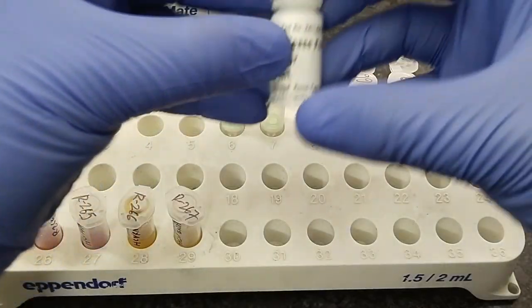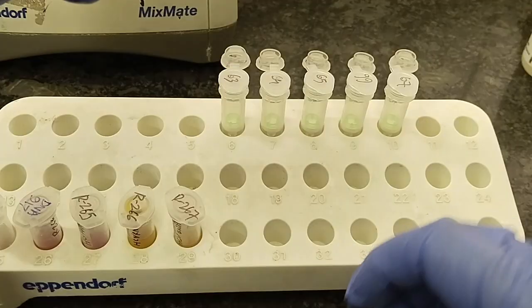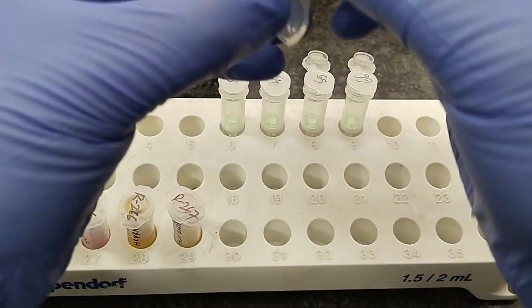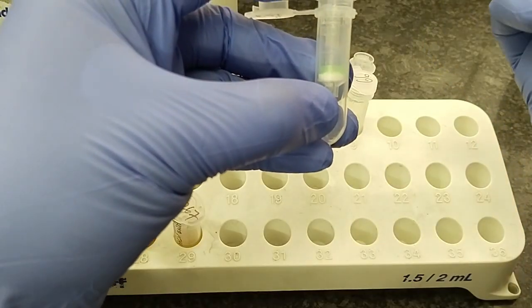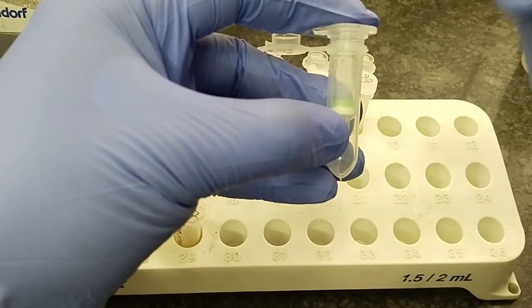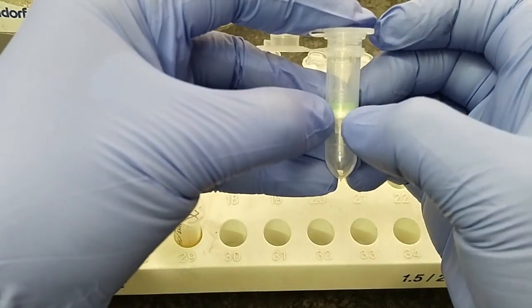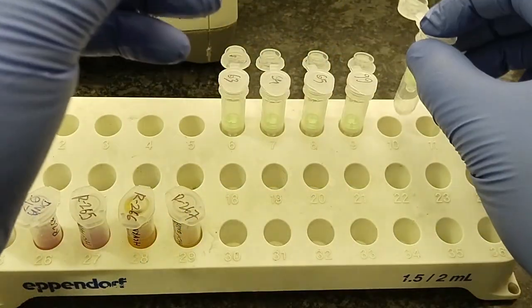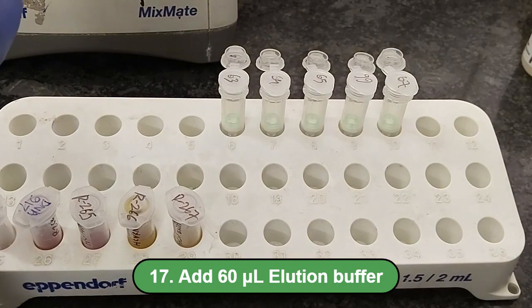And the last step is addition of nuclease-free water. This is one type of elution buffer. As I have told previously, if there is any virus, then RNA gets extracted from the virus, and if there is any RNA particle, it gets attached to the column. So we have to finally extract it out.